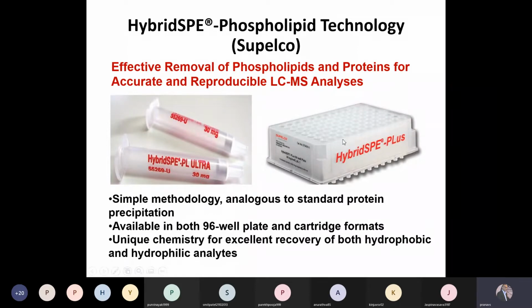And these are the cartridges which you can see. These are commercially available cartridges. These are not simple cartridges. These are expensive cartridges. And these cartridges are different from the conventional SPE which we just saw in the previous discussion. So these have, again, you can see here, this material here, the solid matrix here, which is the solid phase here, in these cartridges, very similar to SPE.